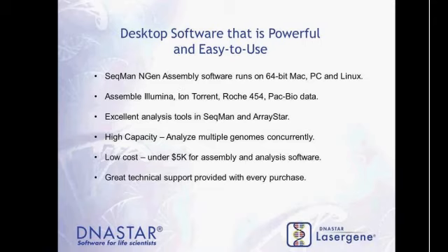assembling them, but we also have some very nice analysis tools. And we'll spend some time today looking at some of the capabilities in those tools. And that will be in our SeqMan software, which is part of the Lasergene Core Suite. Again, if you're a long-term customer, you may already have access to the SeqMan software as part of your Lasergene Core Suite. And then we also have our ArrayStar software that we'll take a look at. Our capacity for the software is very, very high. And we've designed it to assemble and analyze multiple genomes or exomes concurrently.